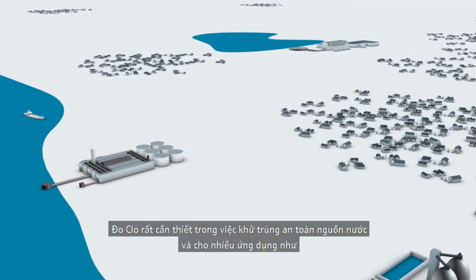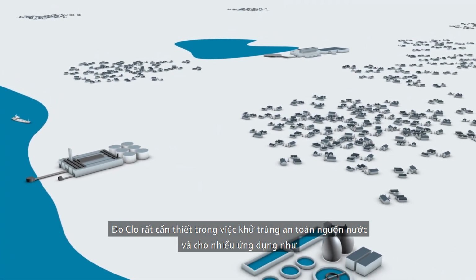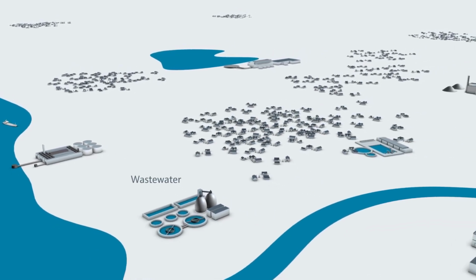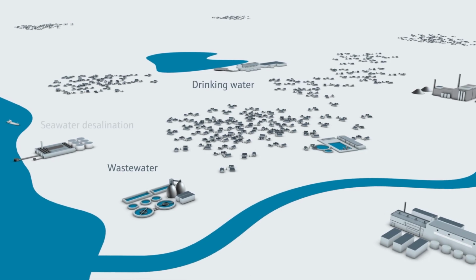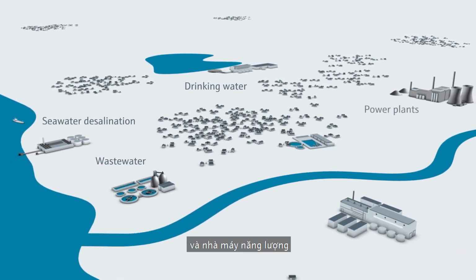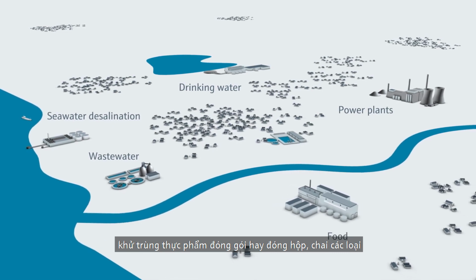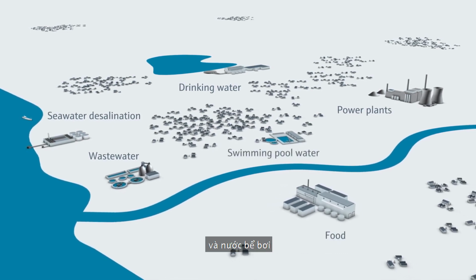Chlorine measurement is essential for safe water disinfection in many applications, such as legally required disinfection of wastewater, disinfection of drinking water, seawater desalination, in power plants, disinfection of packaged foods or cans and multiple-use bottles, and in swimming pool water.